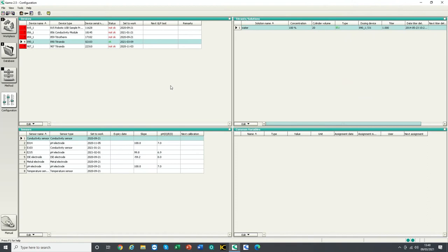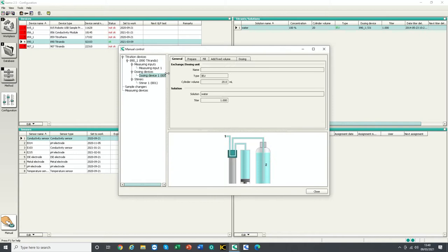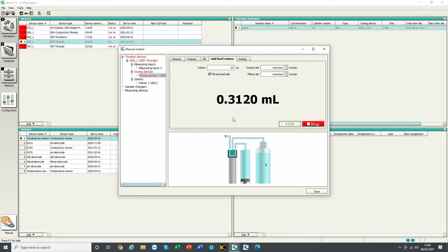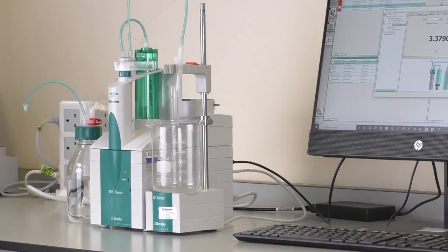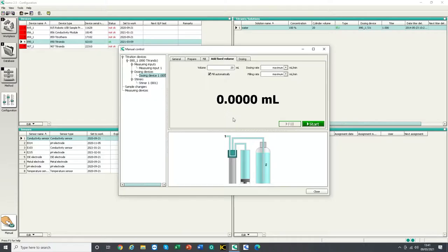In manual control, empty the cylinder unit and allow the cylinder to automatically refill. Expel any remaining reagent from the buret lines using the dosing command in manual control. Then dose the full cylinder volume.